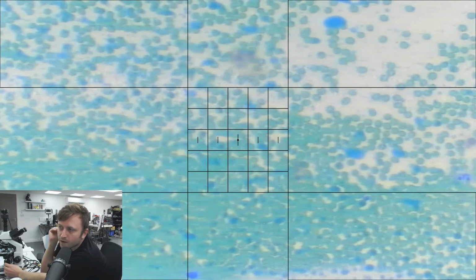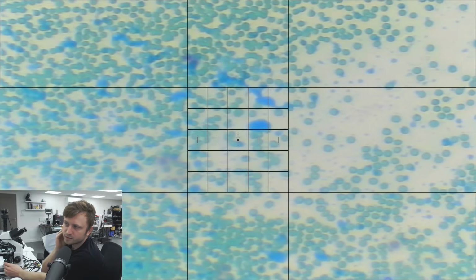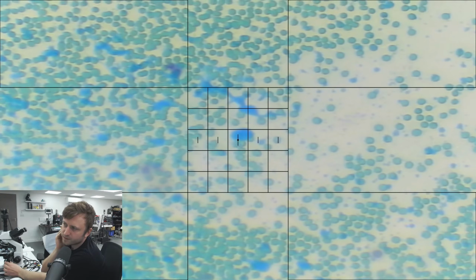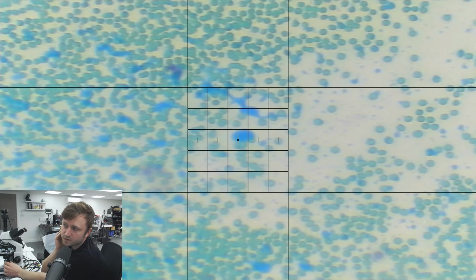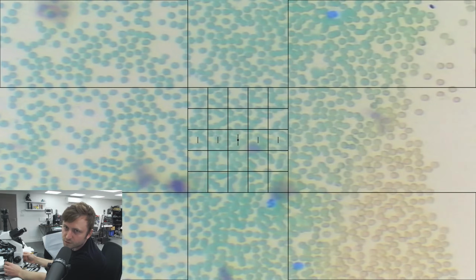What I can imagine is because this is just methylene blue stain, I may only be able to distinguish lymphocytes and neutrophils, at least with my current knowledge. So if I bump into anything that I think is a white cell, but I don't know what type it is, then instead of ignoring it, I might just use a question mark category. So for example, the thing in the middle of the screen here might be a different type of white cell, but we can't tell. As I pan along, I may need to make some adjustments to focus as well.